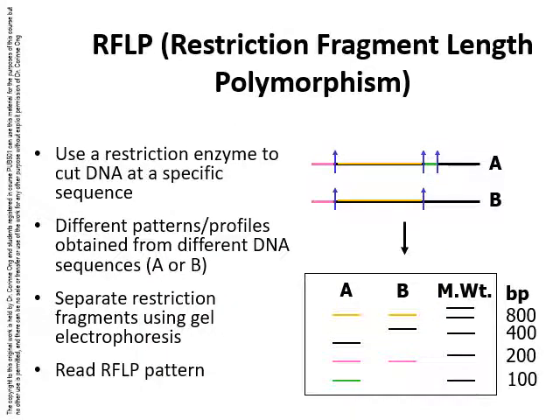Once large amounts of DNA are generated by PCR, genetic fingerprinting can be carried out to differentiate between different virus strains. This can be done using a technique called RFLP, or restriction fragment length polymorphism. Special enzymes called restriction enzymes cut DNA at sites that have specific DNA sequences. This means that for viruses with different DNA sequences, fragments with different lengths will be generated after treatment with restriction enzymes. These restriction fragments can be separated by gel electrophoresis, and the pattern visualized to see if it is identical or a variation.